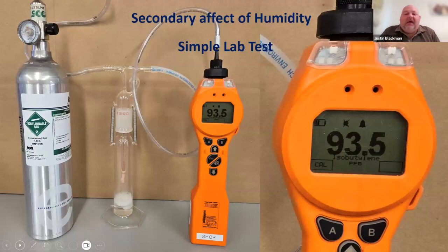And here, I took a freshly calibrated instrument that was reading 100 ppm moments before, and here it is now through a bubbler with 100% humidity, we see a drop in reading. So it's actually not too difficult to do.